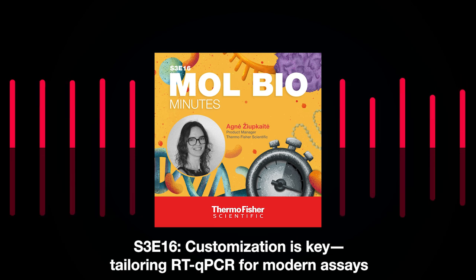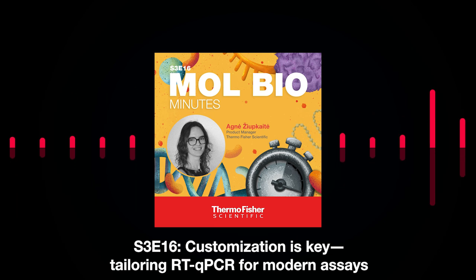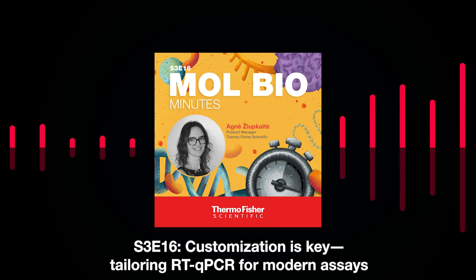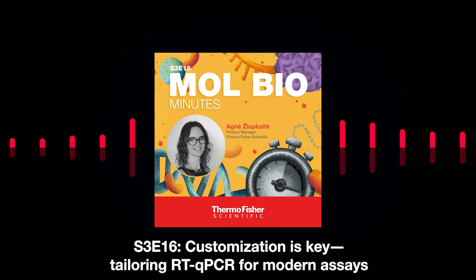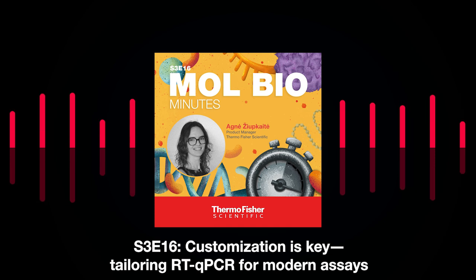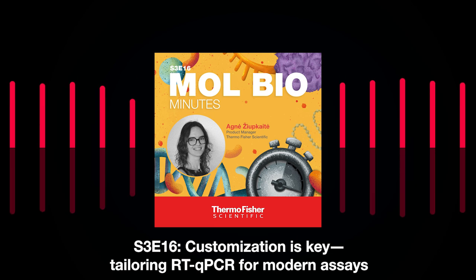This is to say that many of the products you might buy are for research use only, which means that you cannot put them into a commercial kit or assay and resell it if you don't have commercial rights. We encourage you to consider this and talk with your raw material supplier to discuss this and any customization of the product you might need. Working with a supplier that can provide commercial rights is an added value and should be considered while choosing a raw material supplier.